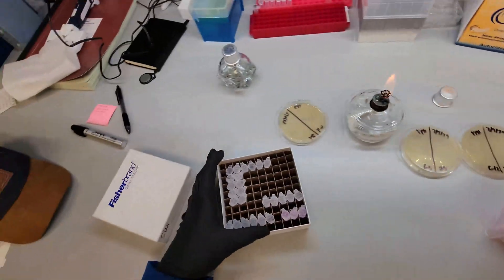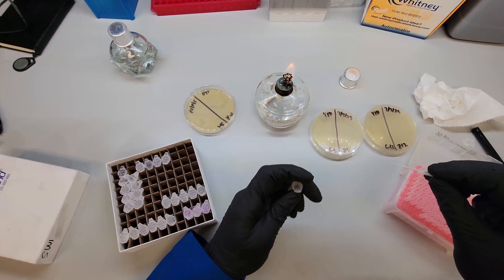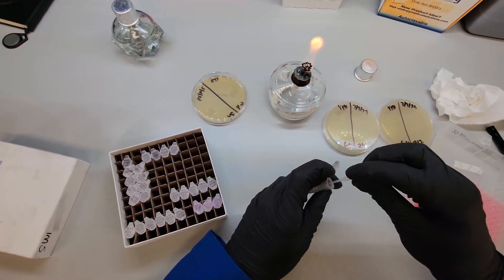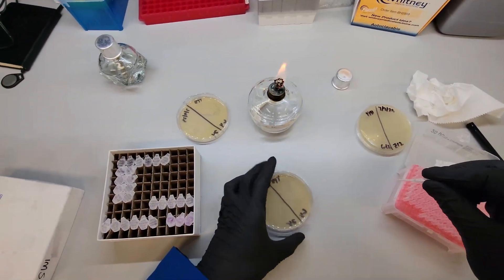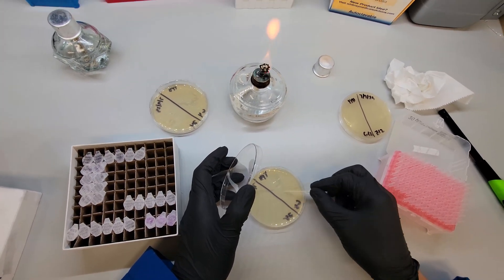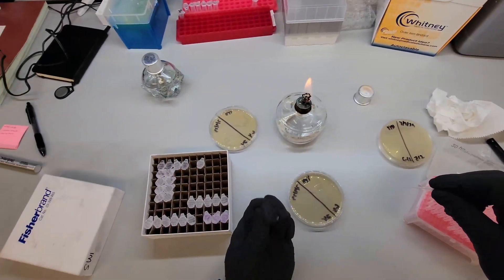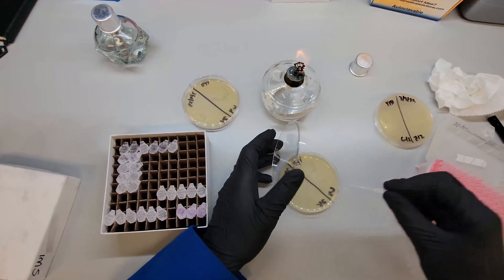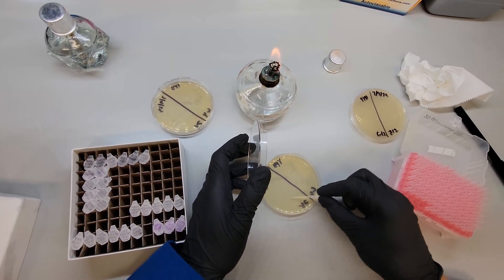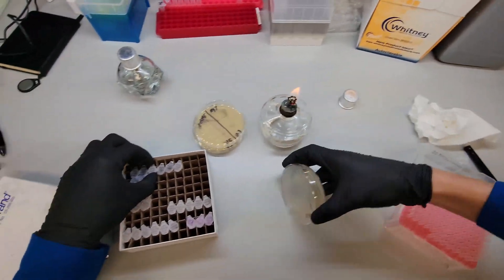You do need to be careful and know what kind of media you need to plate on, so you should label your tubes very carefully. I know these strains are not carrying any plasmids or anything, so we can just put them on non-selective YPD. You can also do streaks like this — whichever is more convenient. You should get pretty good single colonies if you streak out like this.